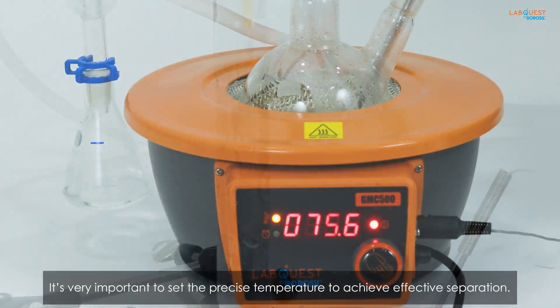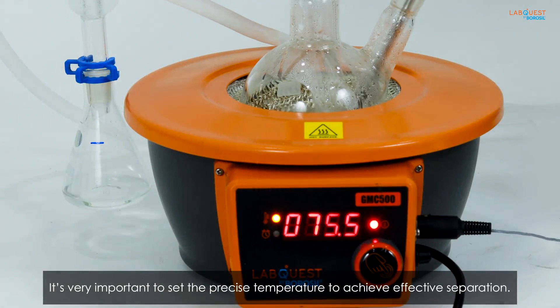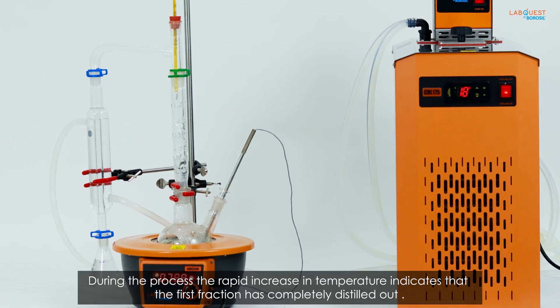It's very important to set the precise temperature to achieve effective separation. During the process, the rapid increase in temperature indicates that the first fraction has completely distilled out.